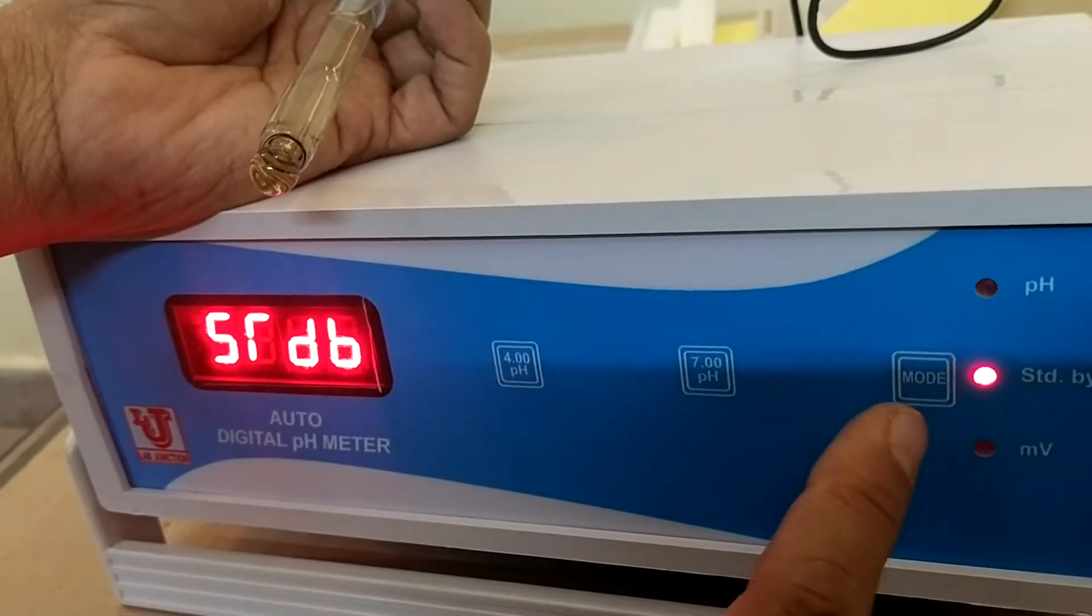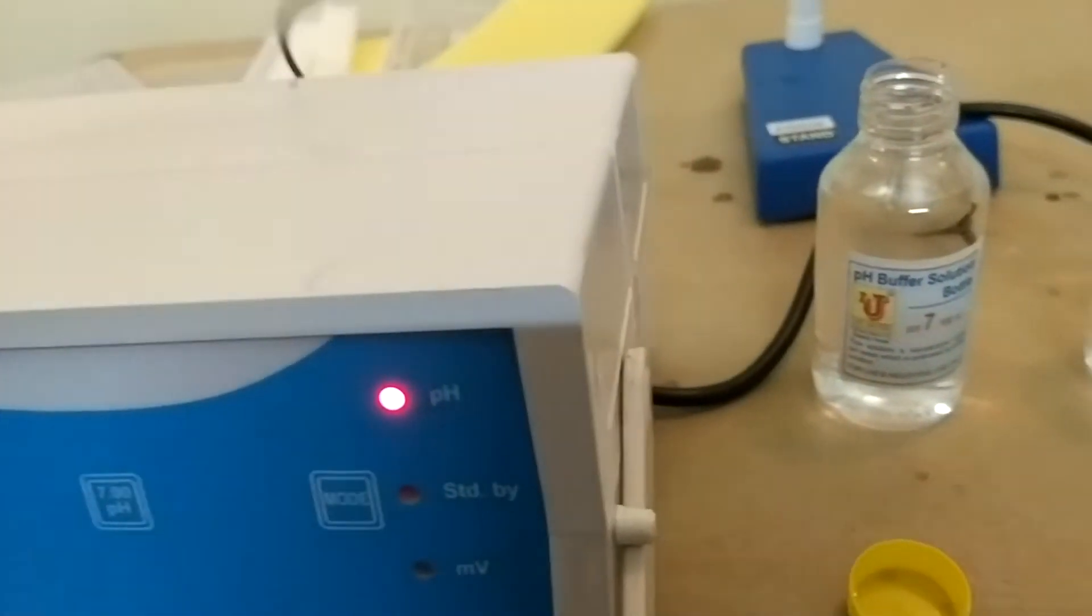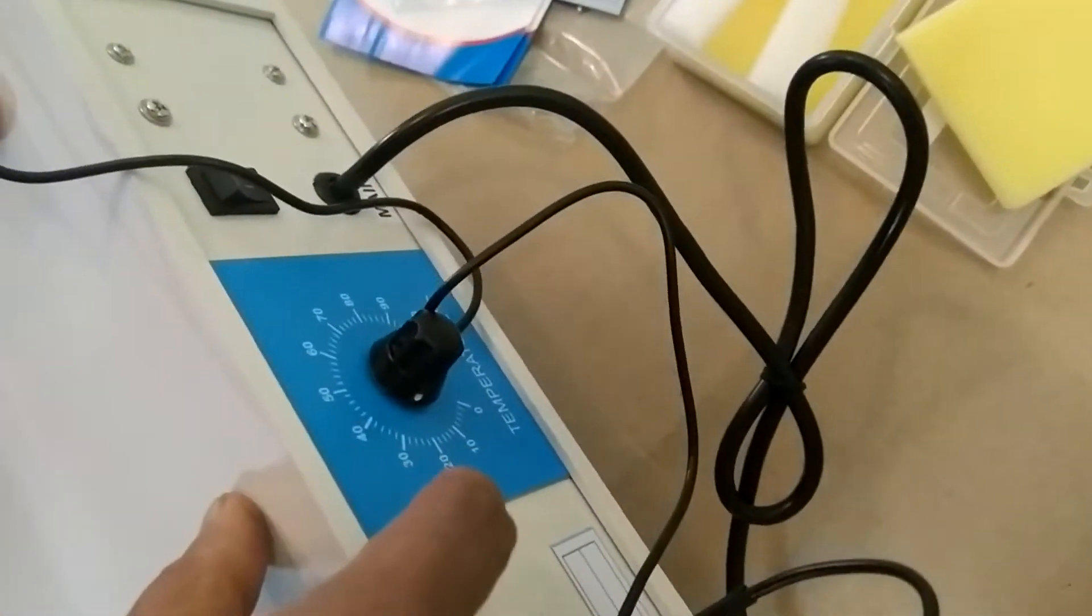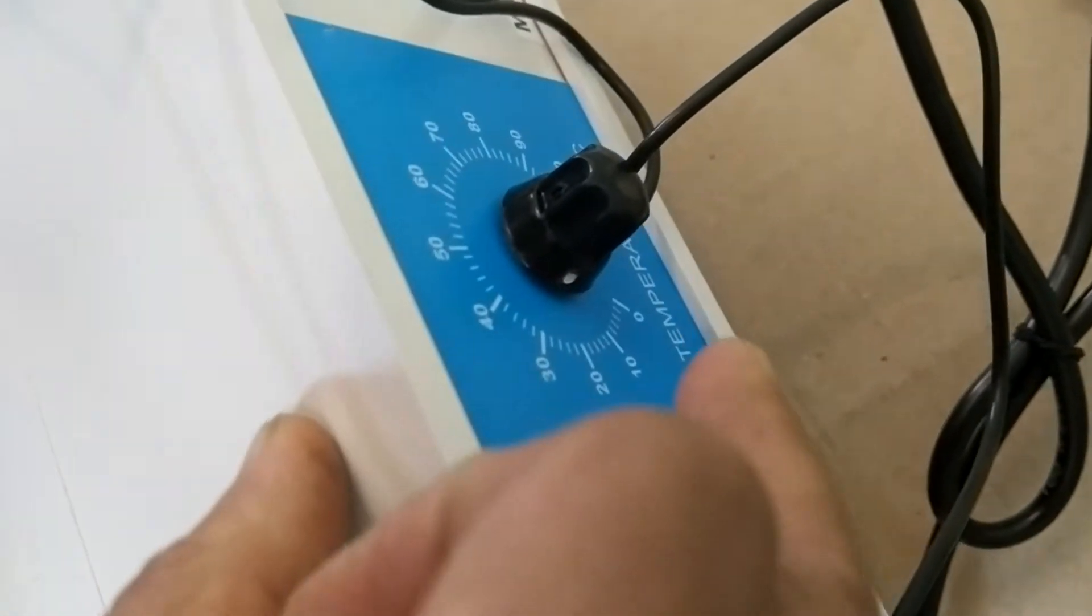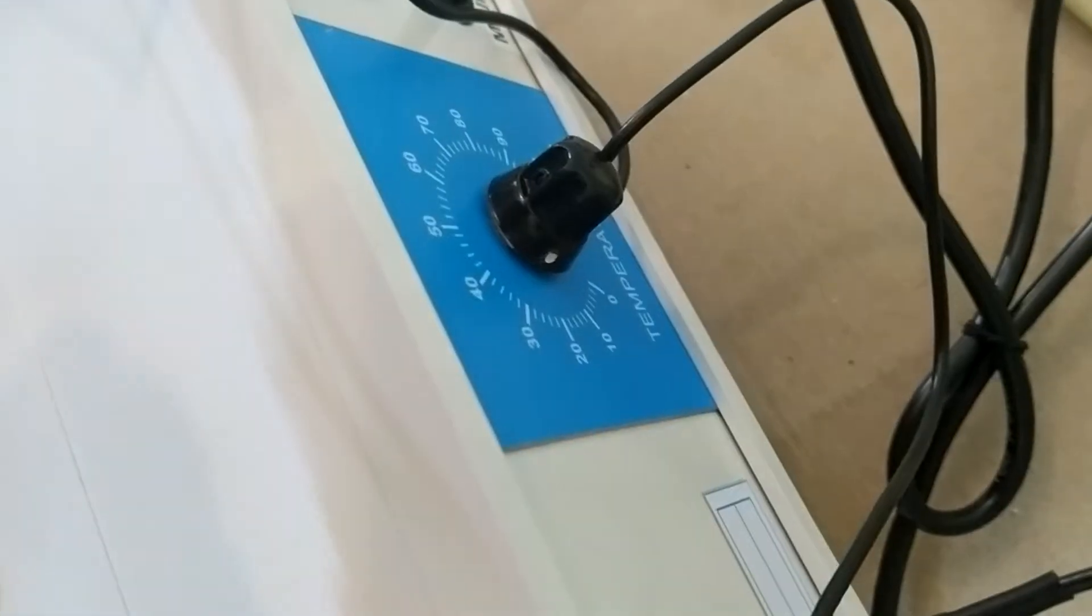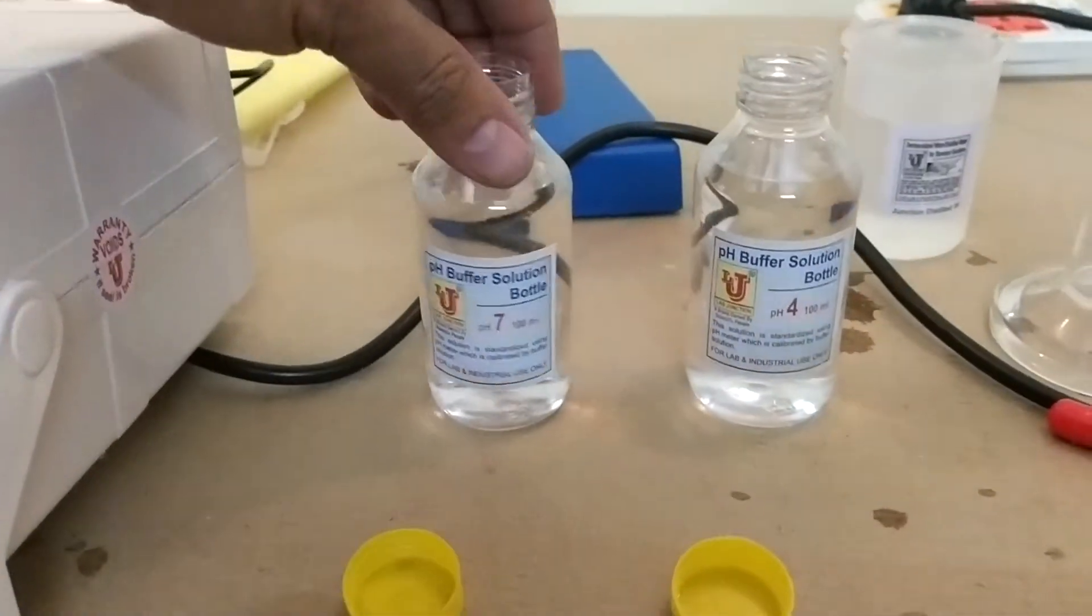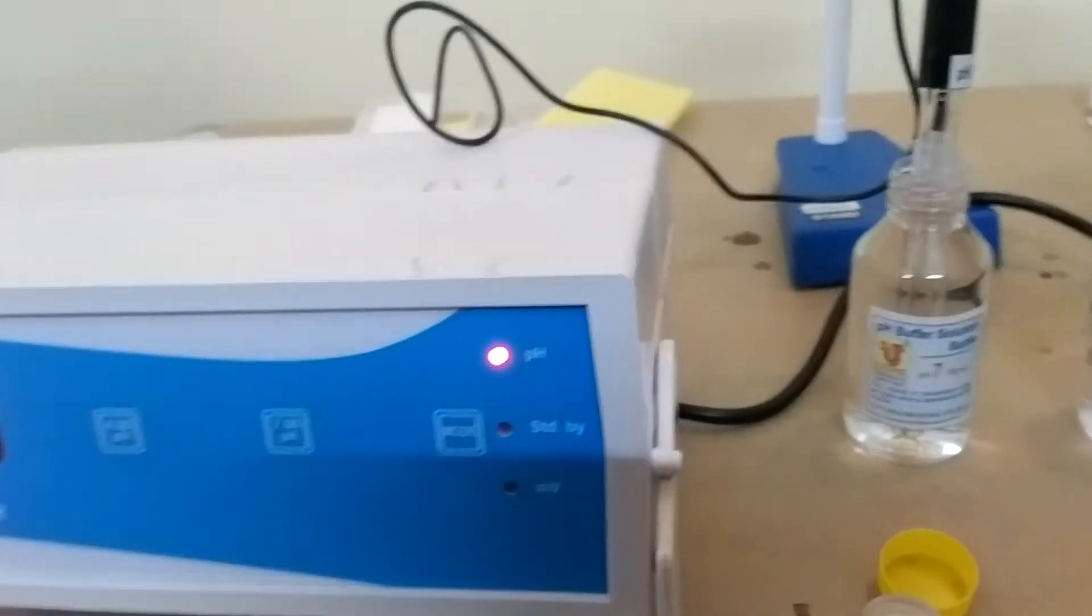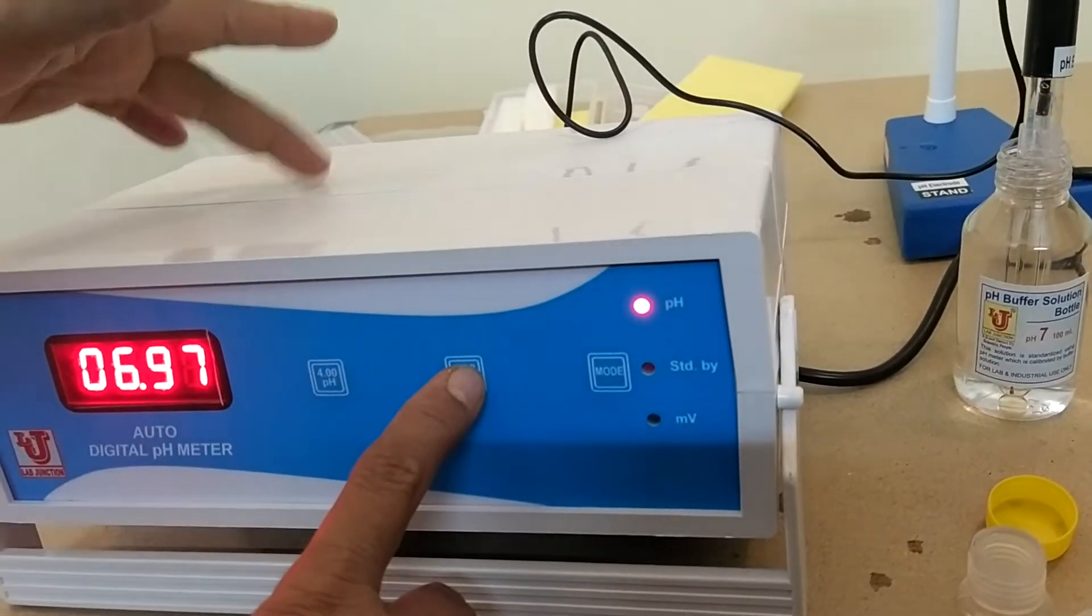Now we can calibrate this pH. Take your temperature from this control. I set temperature to 25. You can set as your demand 20, 30, 40 as ever you want. Now, how we can calibrate this. First of all, always first, you can dip in 7 pH buffer solution. Suppose 6.98 comes, you can press 7.